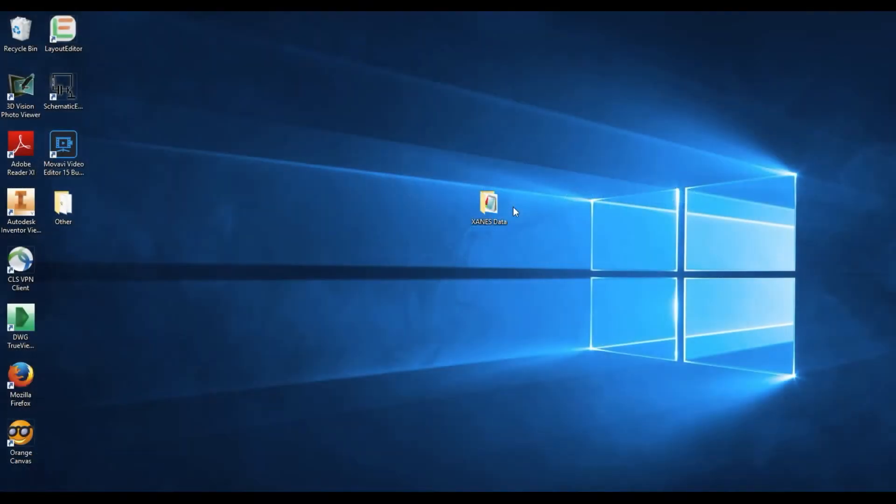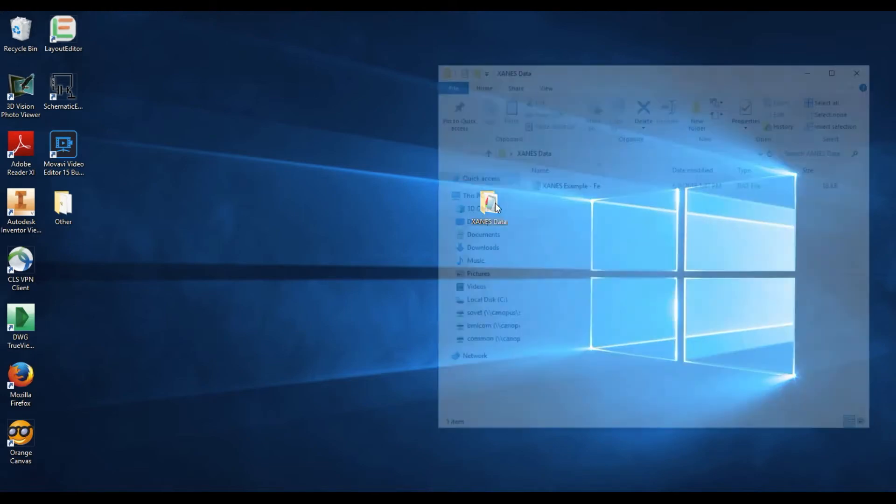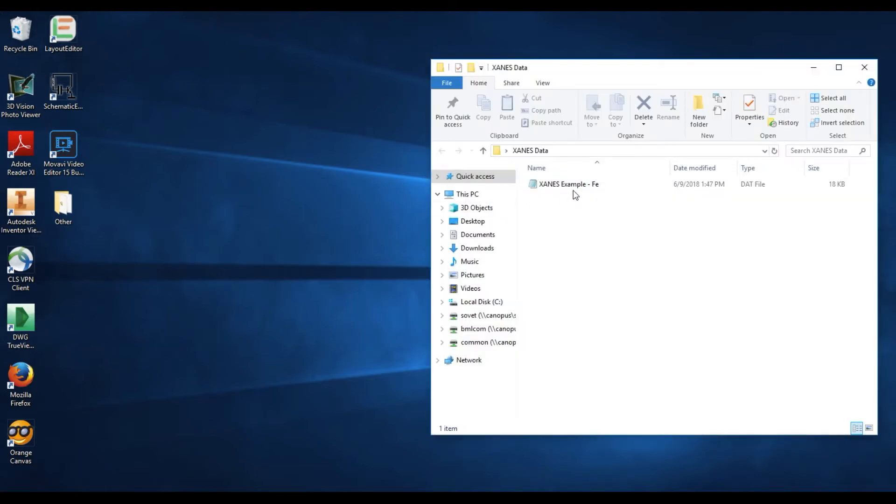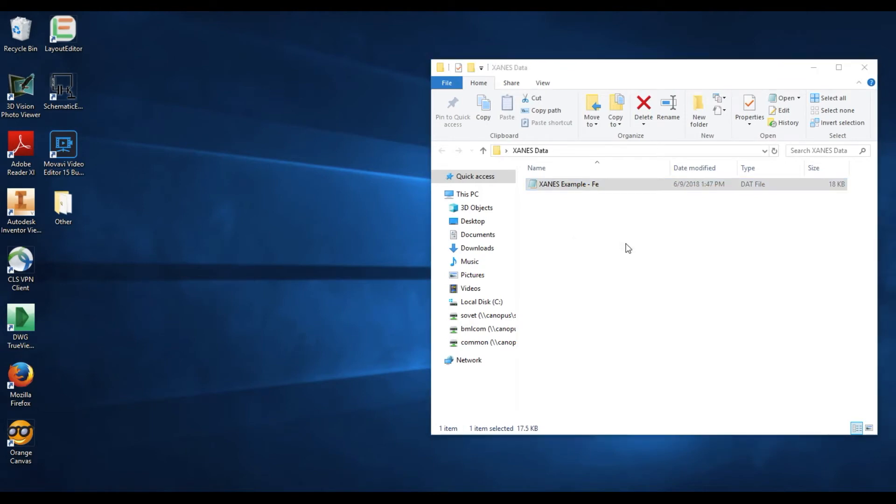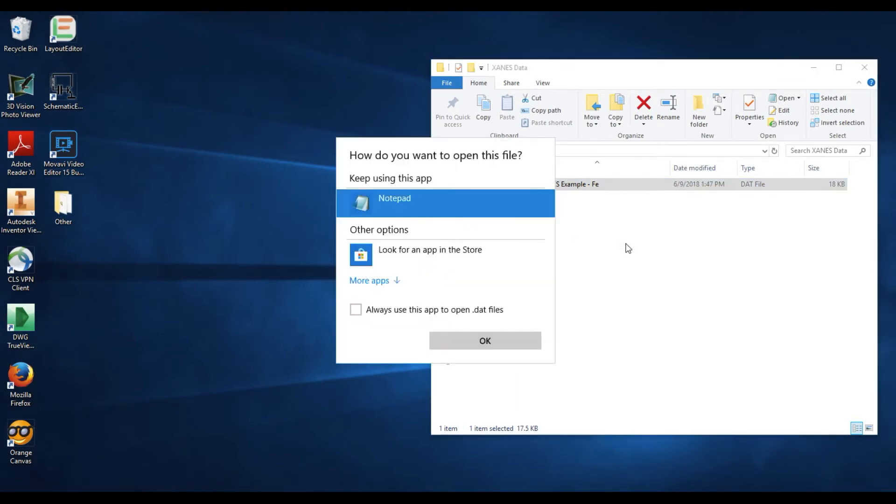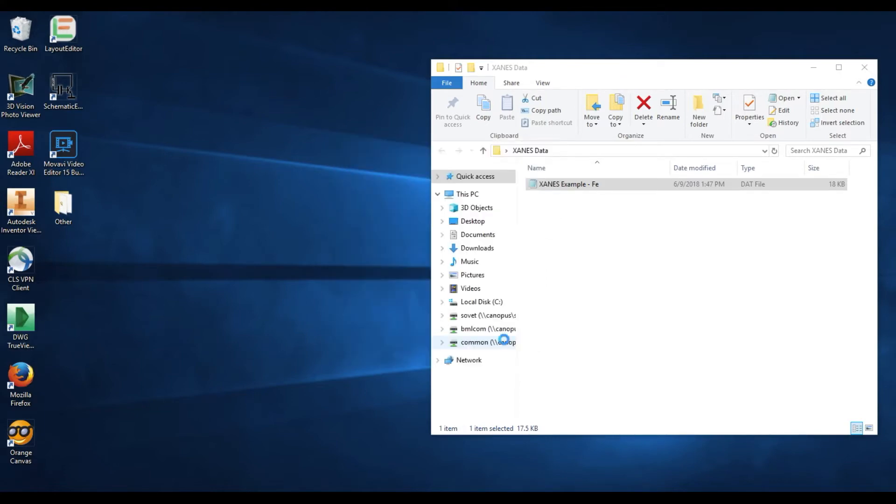To create a XANES graph from XANES data acquired on the IDEAS beamline at the Canadian Light Source, simply open up the data folder containing your data, right-click the data file itself, and select Open With. Choose any text software you're most comfortable with. Notepad is probably the easiest to use. Select the software and select OK.